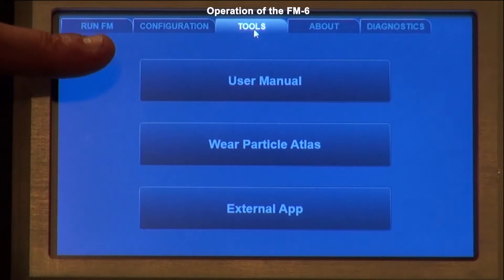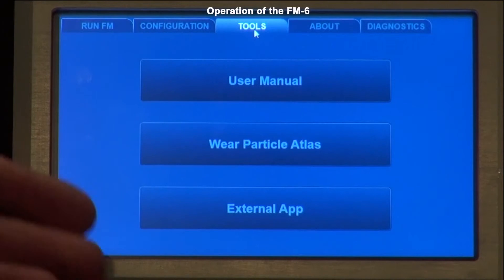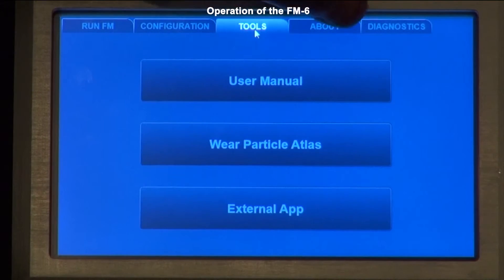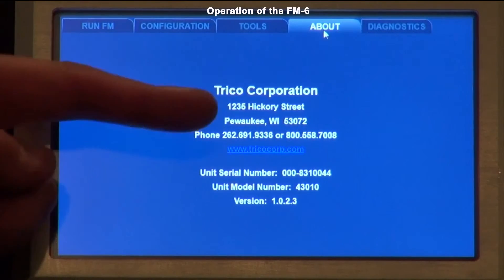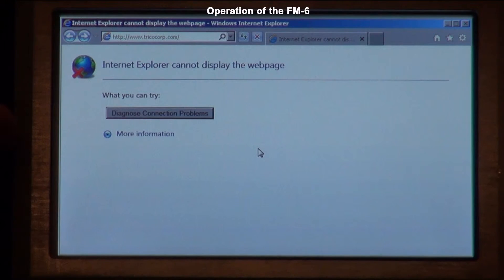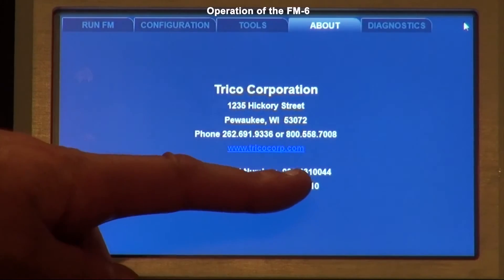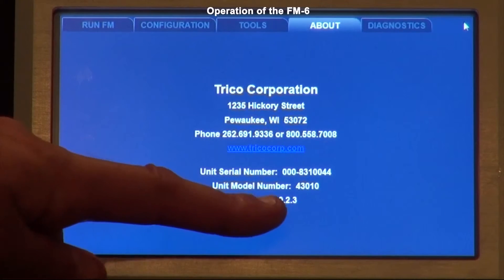The next menu is the tools menu, which contains the user manual and any external applications that can be added to the screen. The next tab is the about tab, which shows the Trico information and website. If you're connected to the internet, you can tap the Trico link to go to the website. At the bottom of the about tab you'll find the unit serial number, unit model number, and the version of software you're running.